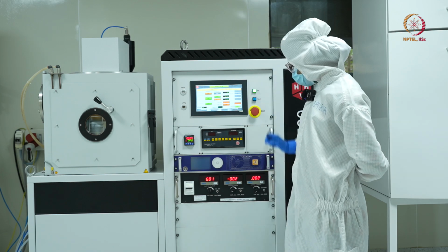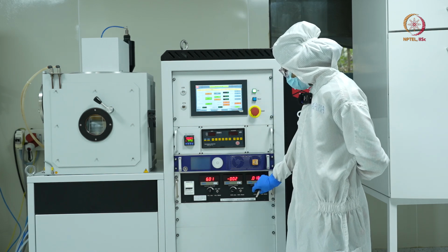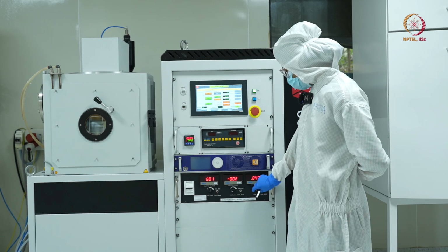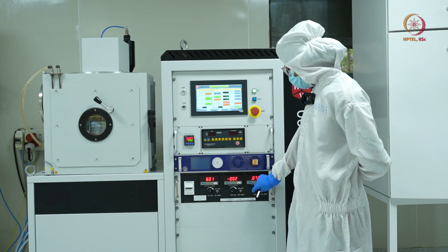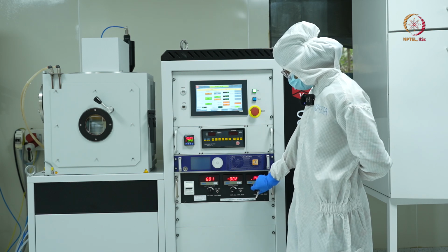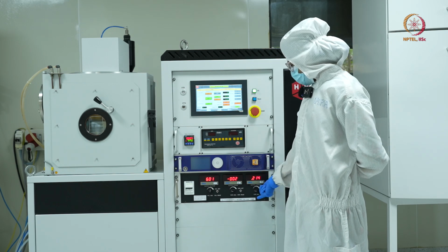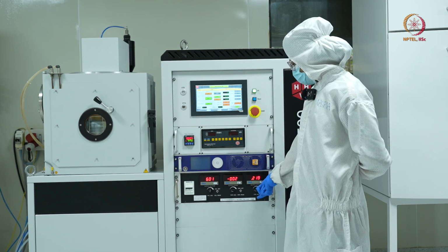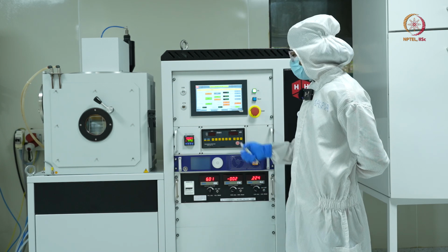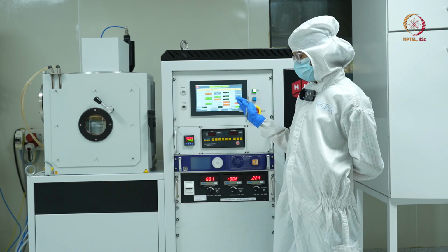Once I have done this, I'll set my current to 0.5 amperes. As I'm increasing my current, there are chances that the plasma will strike with the 10 SCCM gas flow.